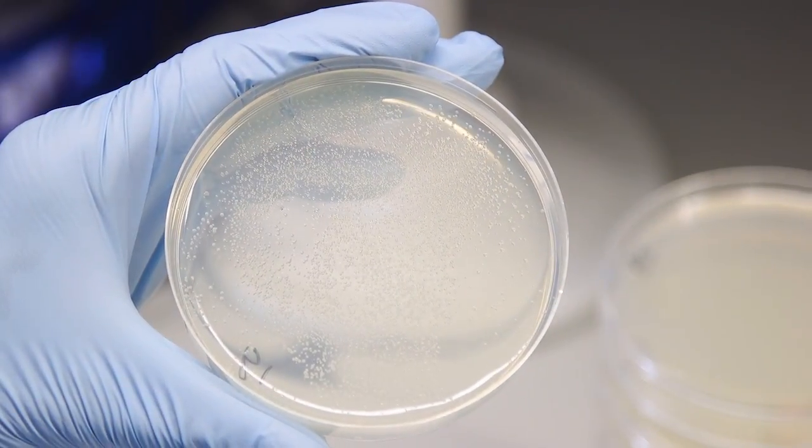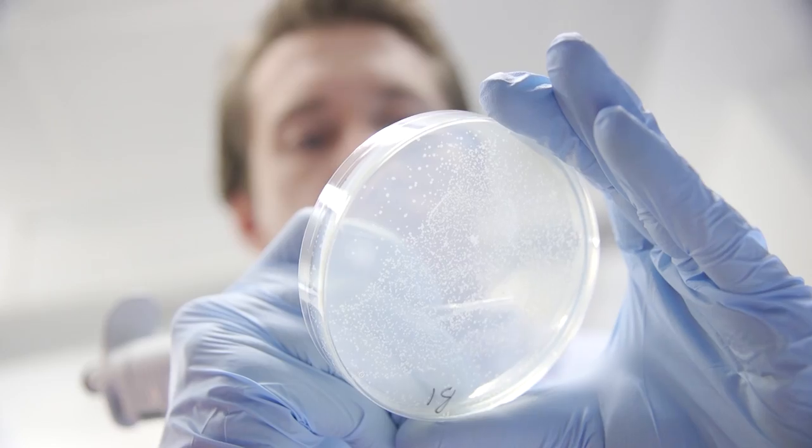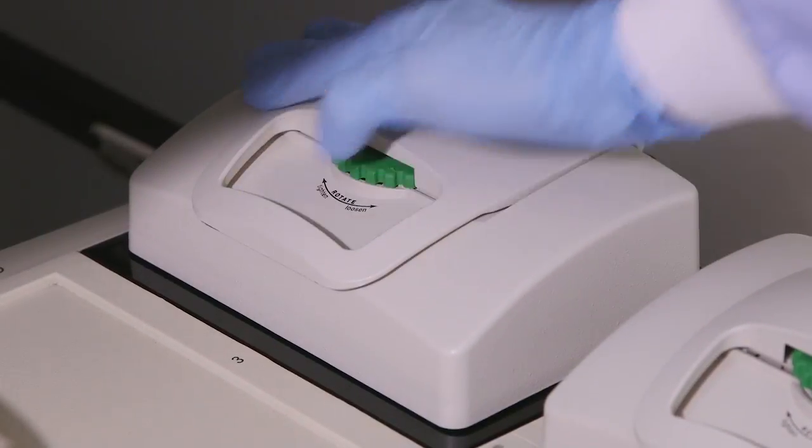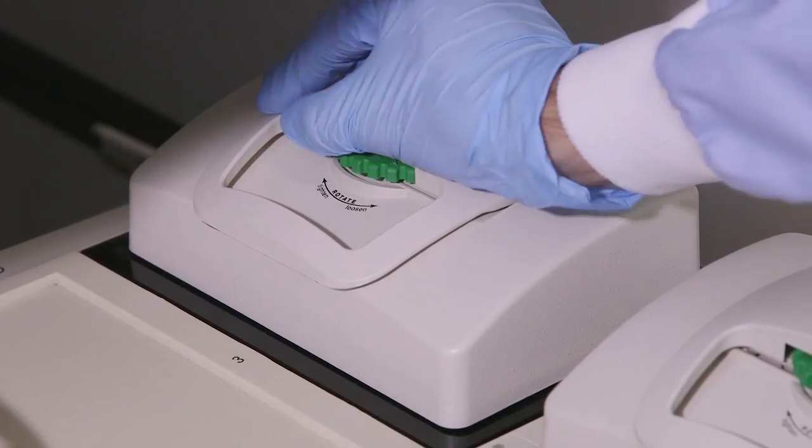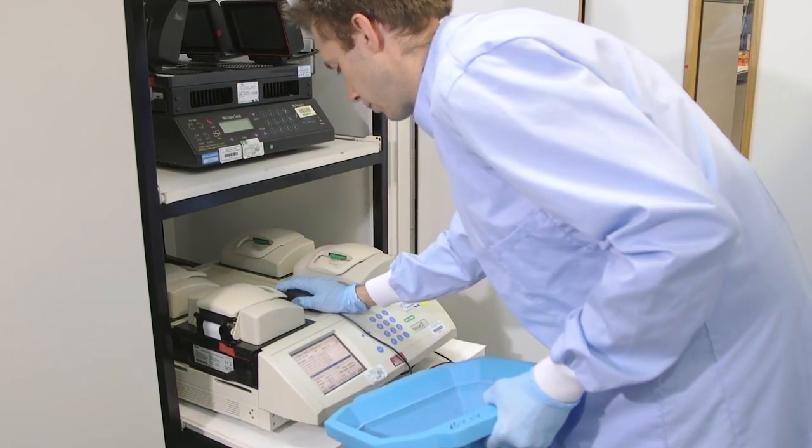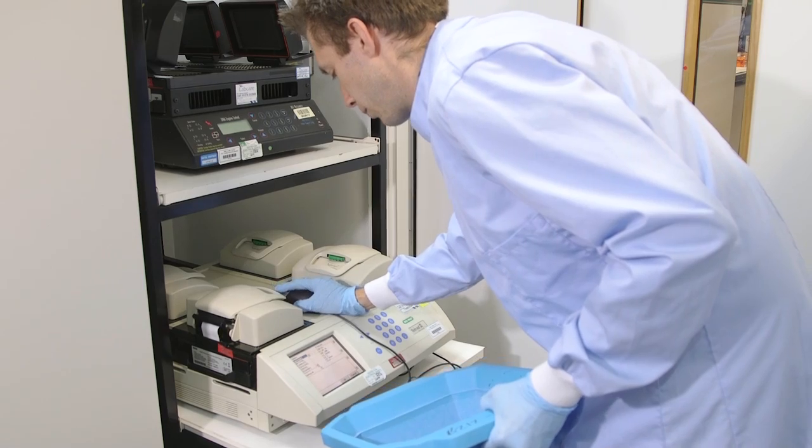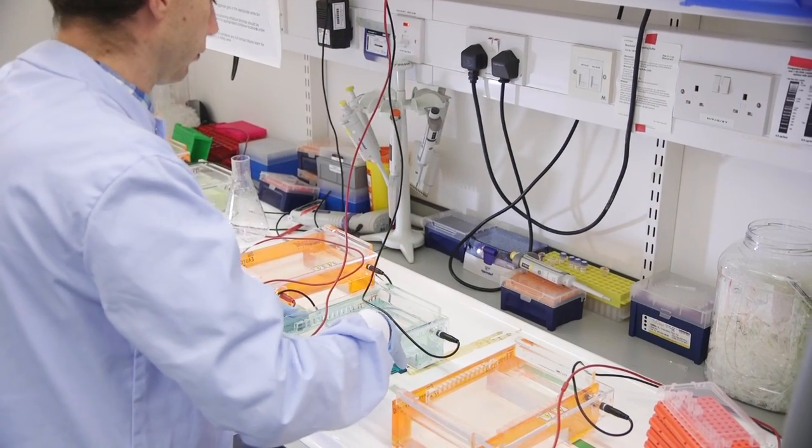Once the bacteria have grown on the plates, we pick the colonies and culture them overnight. As a first quality control step, we run another PCR reaction to confirm that the genomic fragment is correctly modified. We then run the products on a gel and record the results for our sample tracking database.